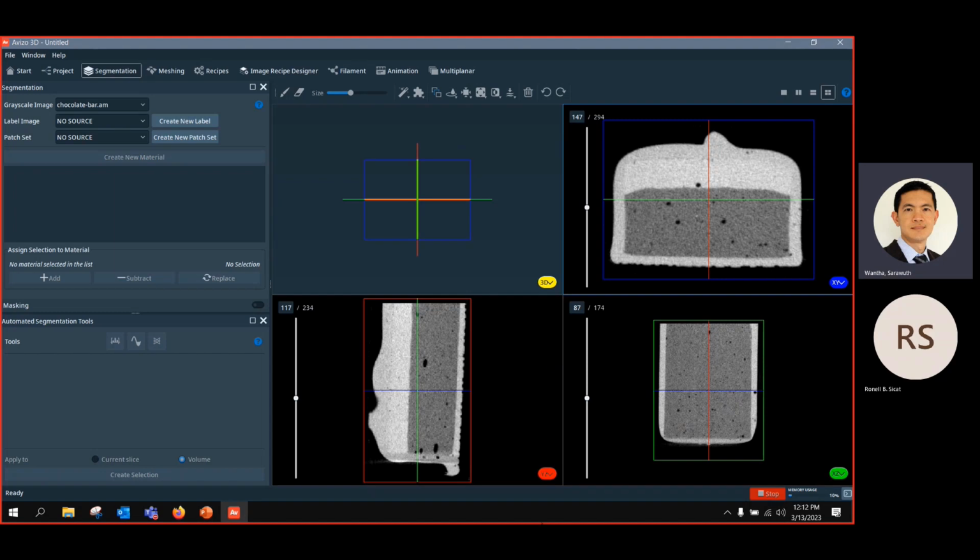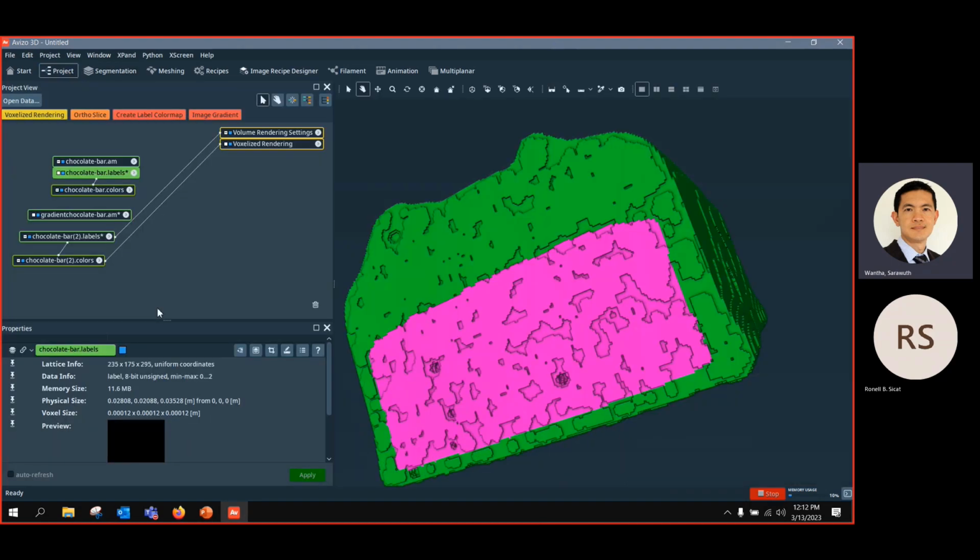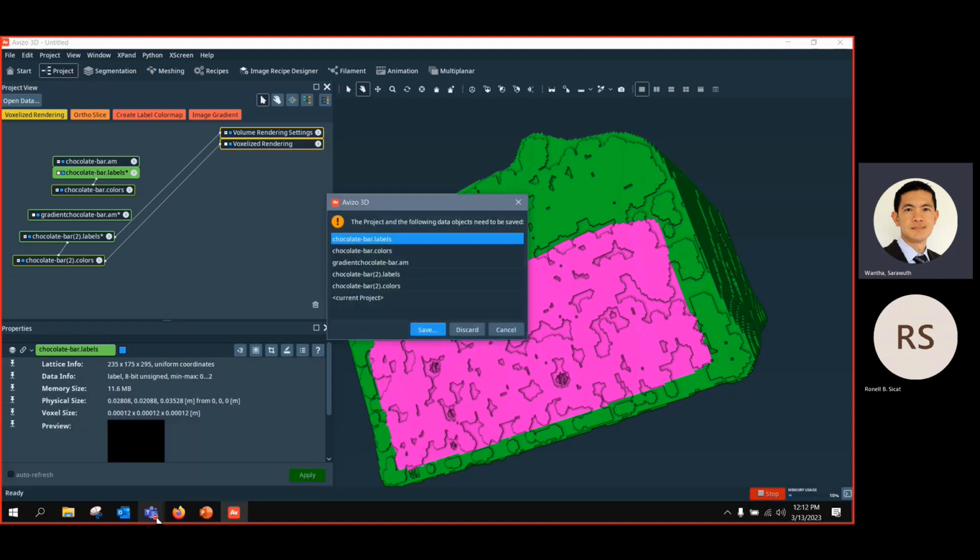Also, in the future, we want to merge both the classic segmentation and the Segmentation Plus workroom together, so everything will be transferred to the new Segmentation Plus workroom. So we're going to use the new one. I loaded some files to the folder, and I'm going to use this one for demonstration of the new Segmentation Plus workroom.